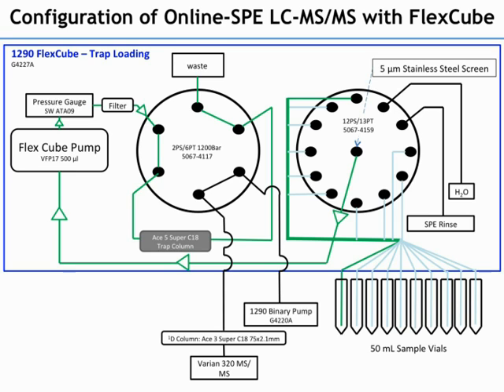In most of our work, we've been pulling in 5 milliliters of each of these samples. The most we've done is maybe 10 milliliters, but it's basically limited by how long you want to wait. The capability of the pump, as she said, is 4 milliliters a minute at the top end and 60 bar. So how much you can load is simply a function of how long you want to wait, how big your particles are, and how long the cartridge is. Typically we're loading at 1 milliliter per minute, and so we wait 5 minutes there.